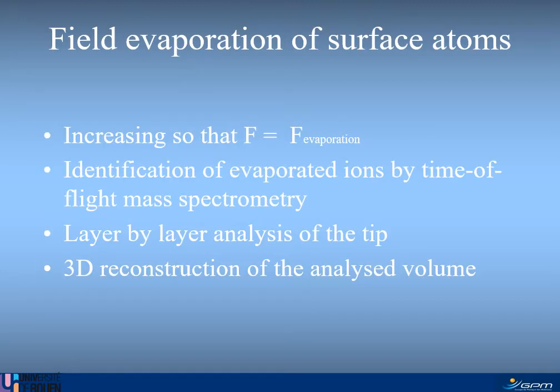So after field ionization, we've got a very important phenomenon that is exploited in atom probe. This is field evaporation of surface atoms. If you increase the electric field by increasing the applied voltage, up to a threshold that is called the evaporation field, you will see field evaporation.